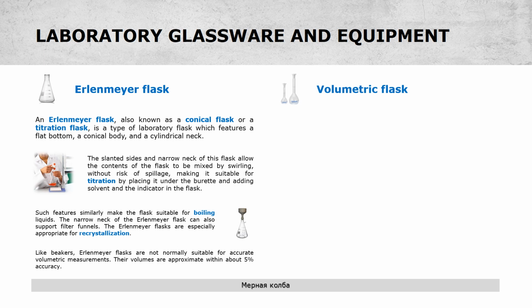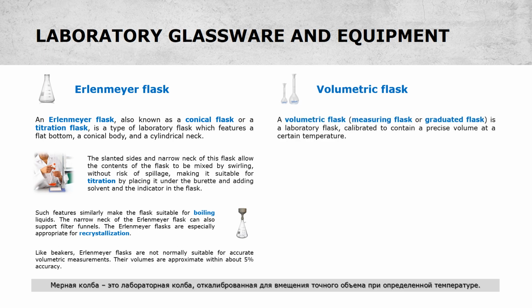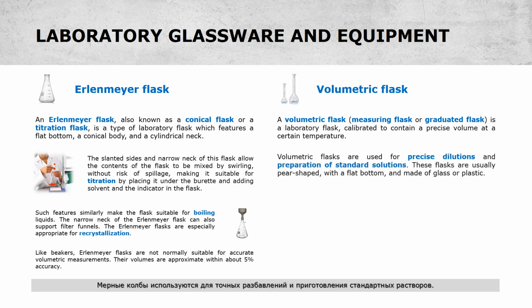Volumetric flask. A volumetric flask, measuring flask or graduated flask, is a laboratory flask calibrated to contain a precise volume at a certain temperature. Volumetric flasks are used for precise dilutions and preparation of standard solutions.